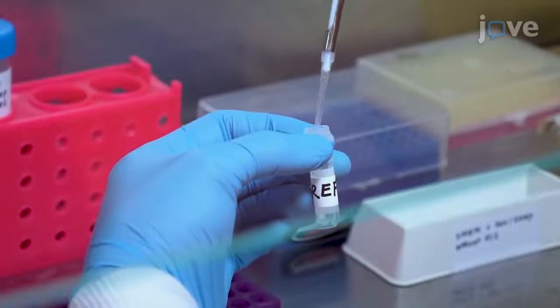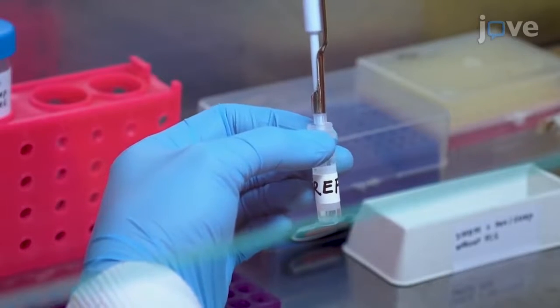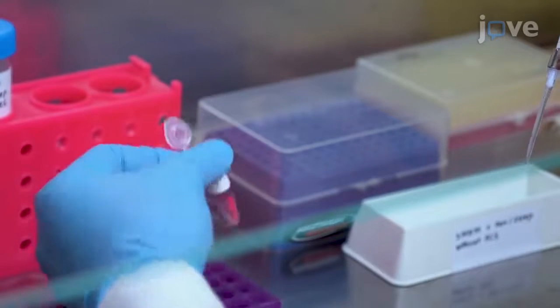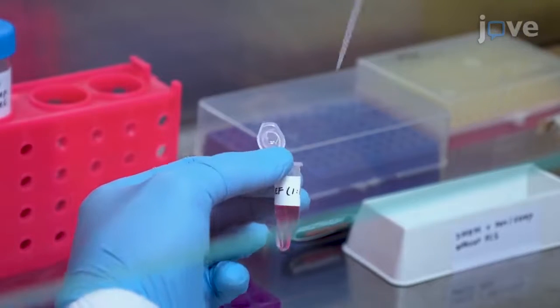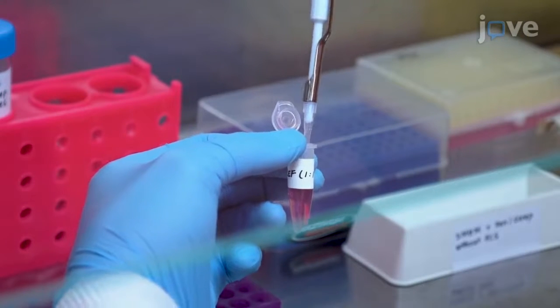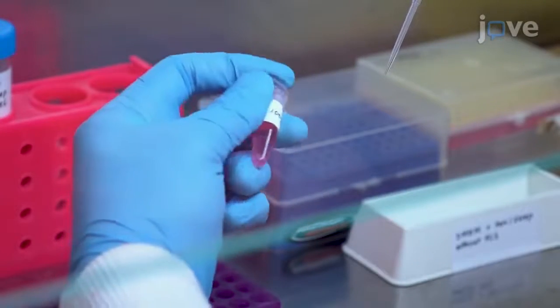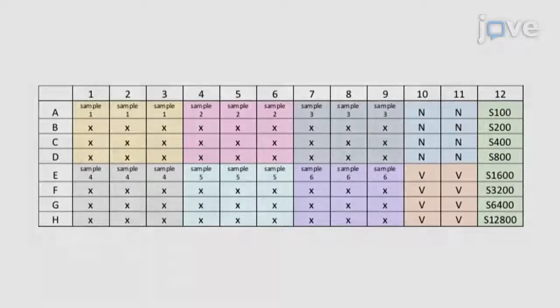Next, prepare more than 110 microliters of a 1 to 100 dilution of the reference serum by mixing 1.5 microliters of the reference serum with FCS-free DMEM media with penicillin streptomycin mixture to a final volume of 150 microliters. Pipette 110 microliters of this dilution into the well.